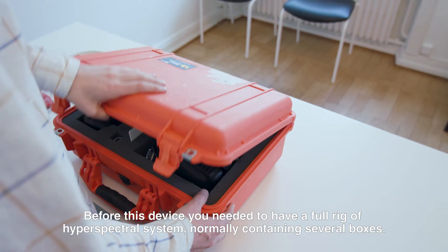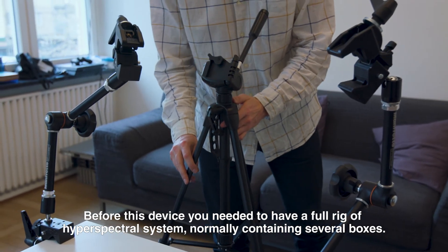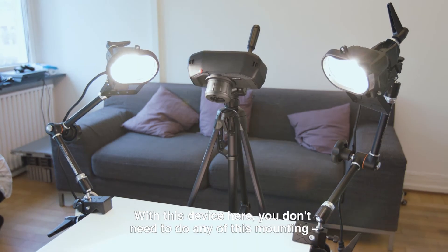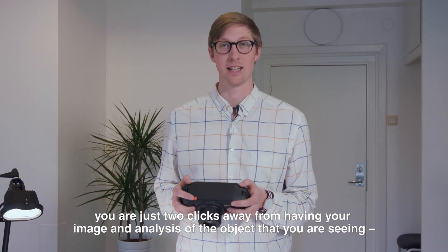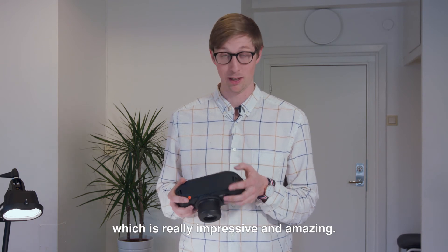Before this device, you needed to have a full rig of a hyperspectral system, normally containing several boxes. With this device here, you don't need to do any of that mounting — you're just two clicks away from having your image and analysis of the object that you are seeing, which is really impressive and amazing.